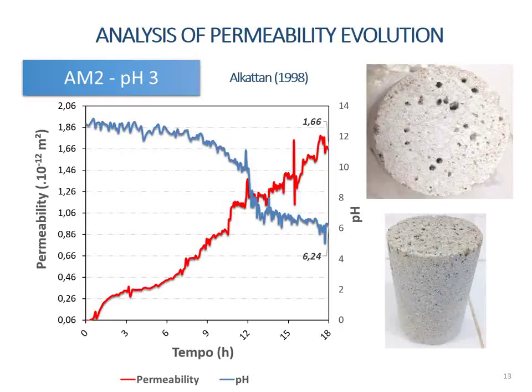In a study by Alcatan, it is possible to observe the relation of the rate of dissolution of the carbonates with pH. In Alcatan, tests were performed varying the pH from 1 to 3, and it was observed that the reaction rate for rocks subjected to the fluid in this pH range was higher than the speed found in the test with the other pH values.